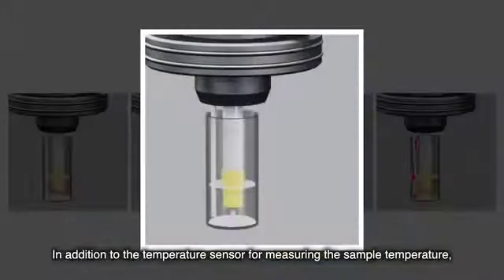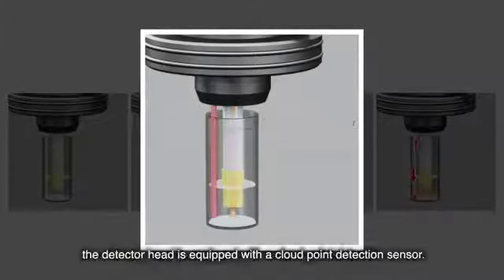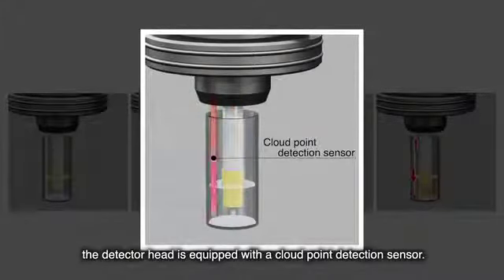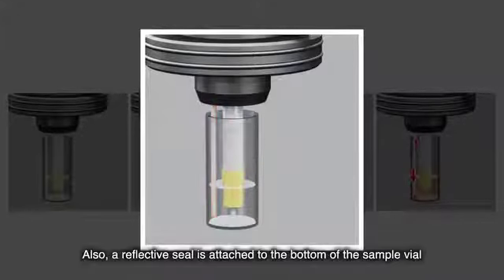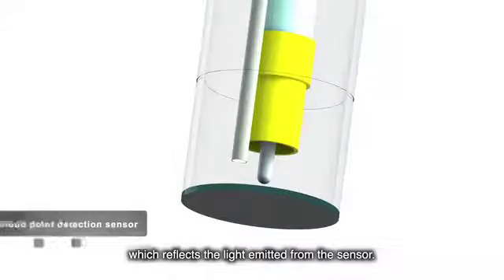In addition to the temperature sensor for measuring the sample temperature, the detector head is equipped with a cloud point detection sensor. Also, a reflective seal is attached to the bottom of the sample vial which reflects the light emitted from the sensor.